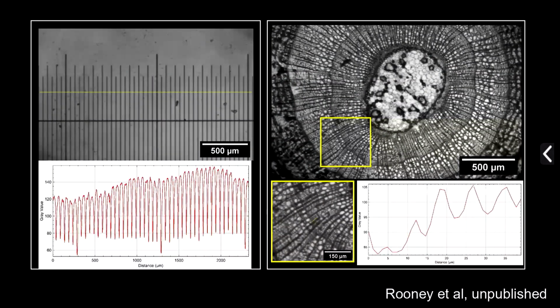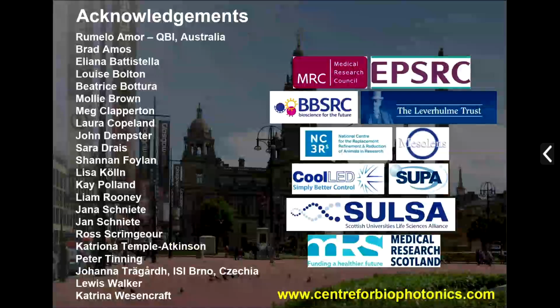We've also been able to use them for imaging. At the moment, it's not mesoscale imaging, but that's where we want to go next. We think we can do better in terms of the resolution performance, but at the moment it's on the micron scale. We think we can improve on this greatly.